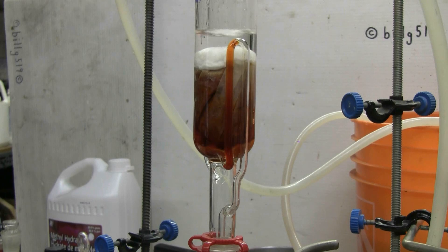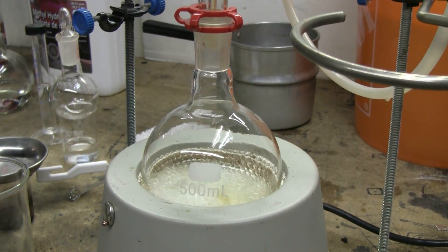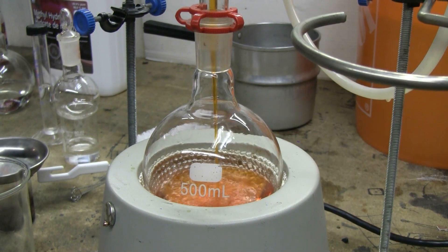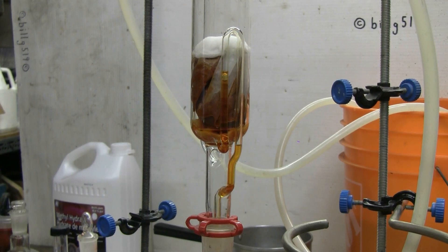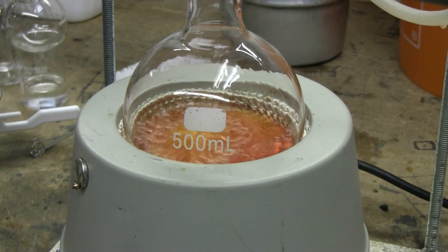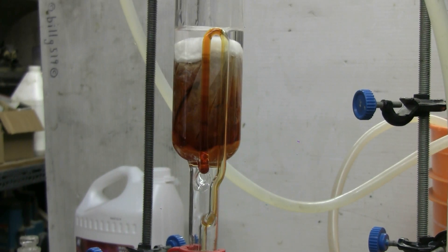A few minutes has gone by since I turned on the water flow to the condenser and the heating mantle. We can see the hot chili powder extract is orange and it's about to siphon. The ethanol is still clear but it's turning orange as the first few siphoning drips come down, and now the full drain of the first cycle. That first cycle brought a nice orange color down into the boiling flask.